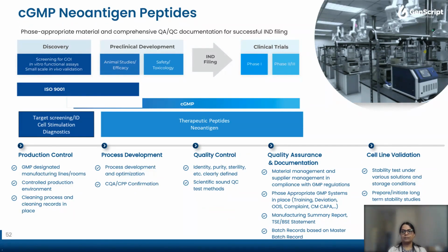Peptide synthesis for neoantigen is an important part of the neoantigen based cell therapy process. However, neoantigen peptides are commonly quite difficult to synthesize, as they can be highly hydrophobic and variable in length and charge, and have a strong tendency to aggregate. Therefore, neoantigen peptide synthesis can be a significant bottleneck in the timeline of clinicians generating personalized immunotherapy.